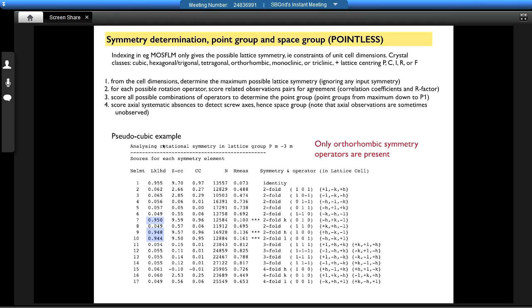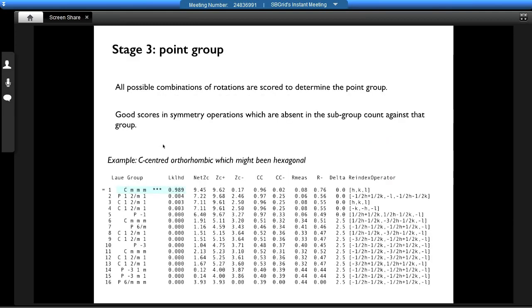Note that it's very common, if you rotate around one of the axes, which you may well do either deliberately or by mistake, that you won't get the data along one of the axes because it's in the blind region, and then you don't have any information about that.